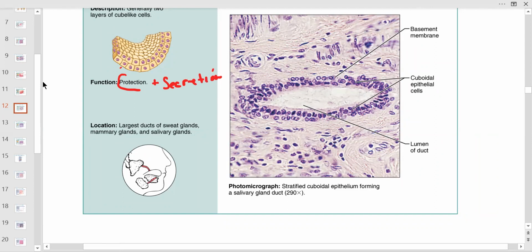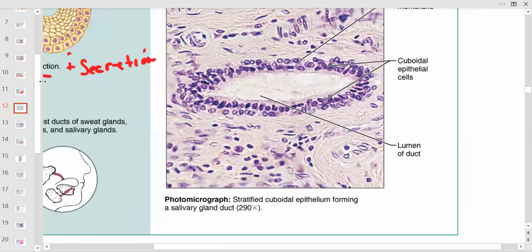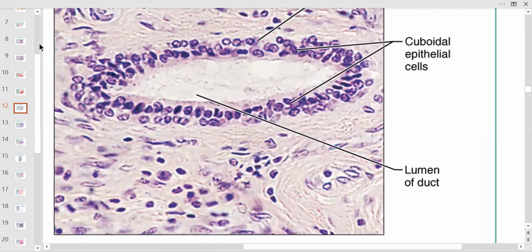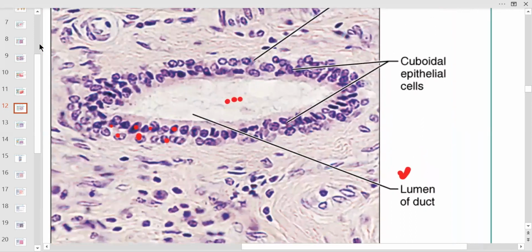So salivary glands, cuboidal, and this is stratified cuboidal, right? It's stratified. There's two layers, correct? So if this is a gland, like a salivary gland or a sweat gland, this is all the lumen. Remember this word lumen, I use that a lot. So this is the tissue, and I'll have a pointer pointing to it. And you can see that there's two layers of cells by the nuclei. So this is stratified cuboidal, not simple cuboidal, stratified. Hard to see the basement membrane, so the real histology.